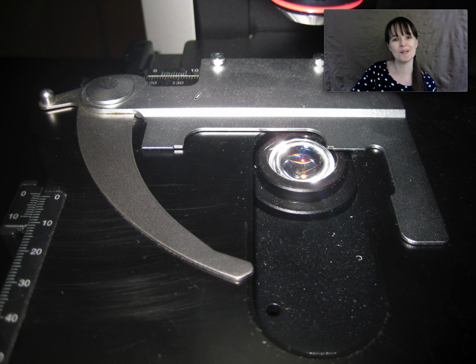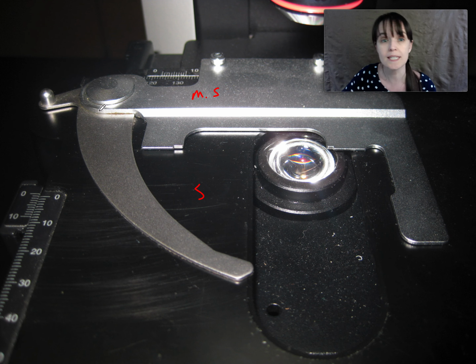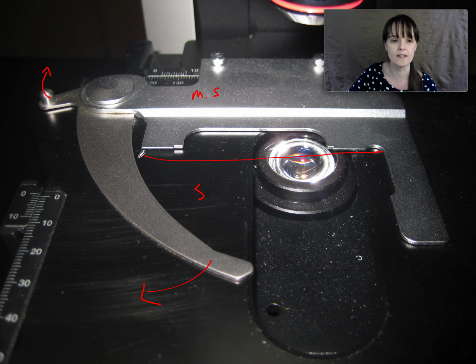Ooh, here's a better picture of the mechanical stage and the stage. To put the slide in, you see how there's a little hinge here and a little knob and a little lever here. When you push that back, it opens this up. And then you put the slide right here. Actually, it'd be bigger than that.